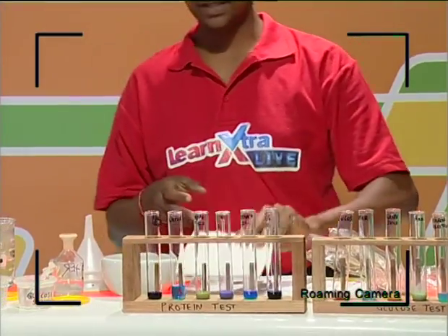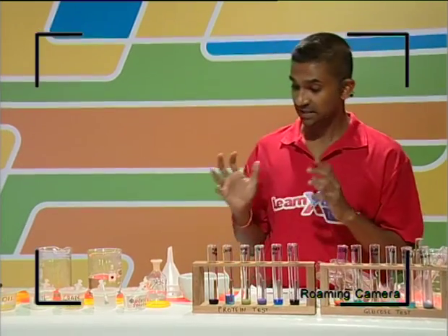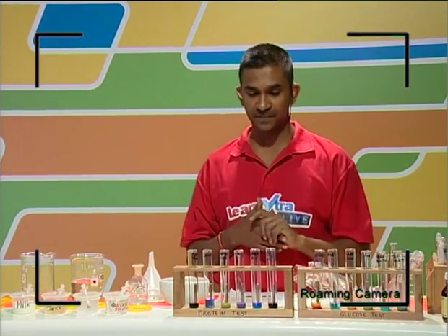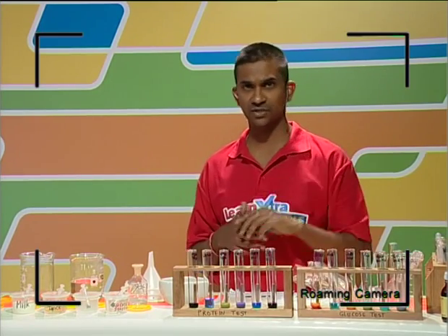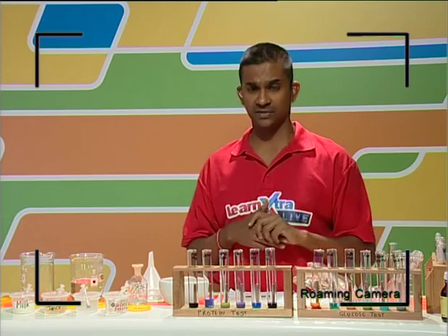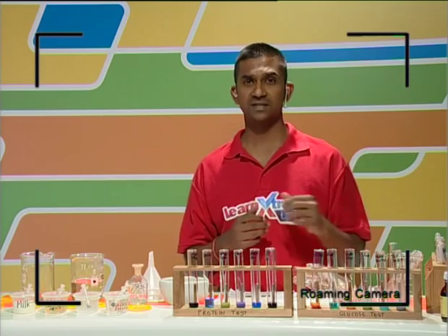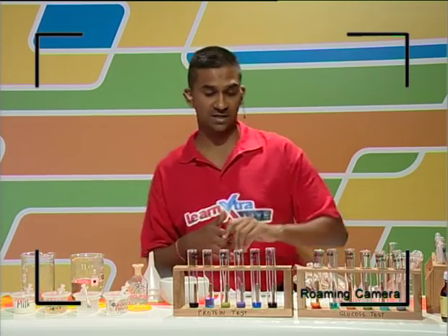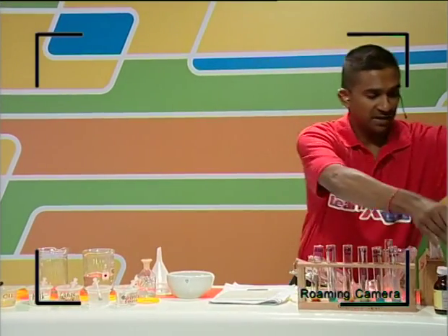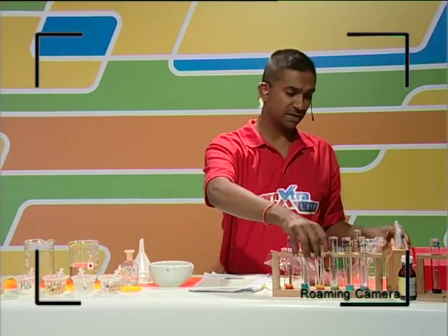So we're done with the protein test, guys. I'm going to keep these on one side. We're now going to look at testing for the presence of starch, and we're going to look at testing for the presence of lipid. The starch test is quite easy because we're going to use iodine, but the lipid test required some prep work, which I did when I was at the lab, but I'm going to obviously show you how to do the experiment. I'm going to show you the results, and then we move on to the starch test. So I'm going to just leave these aside for you guys for a little while so you can have a look at it when we get back and when we interpret these results after the break.